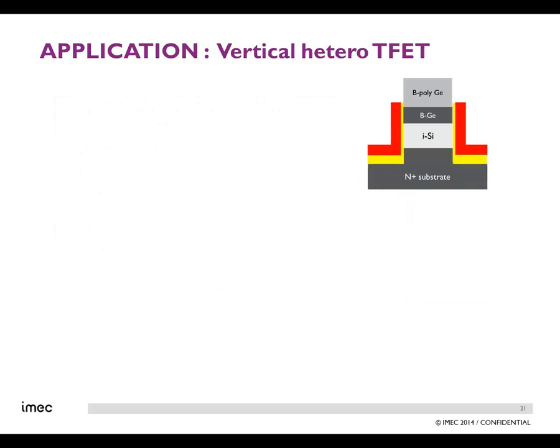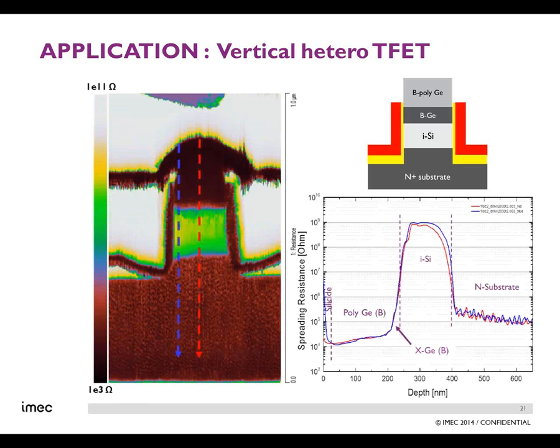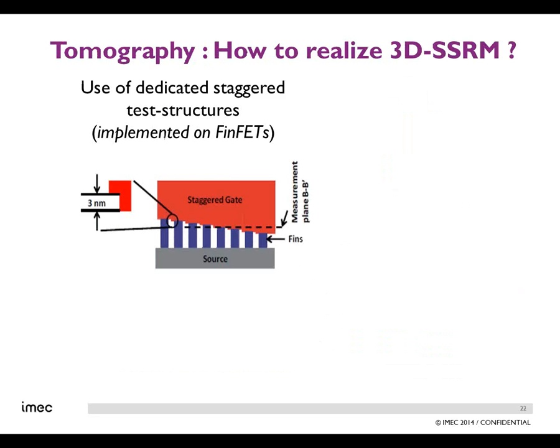FinFETs, and then even more localized 3D structures: TFETs inside nanowires. Basically vertical TFETs, tunneling field effect transistors inside nanowires, is also a very important and growing field. And you can see here we were able to image such a nanowire and also to make sections inside it and to make studies about, for instance, the change of the profiles at the center or at the outer shell of these circular cylindrical nanowires. And you could see the comparison with TEM once again.